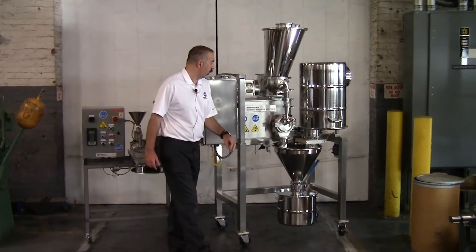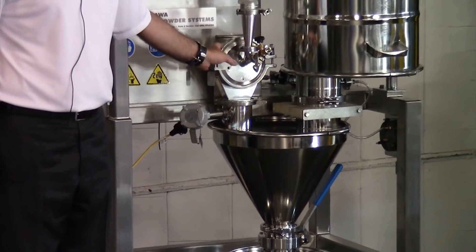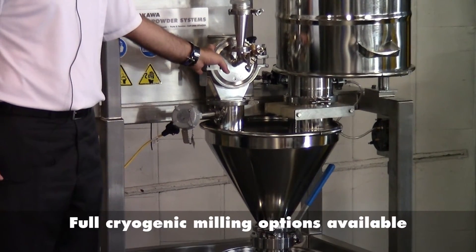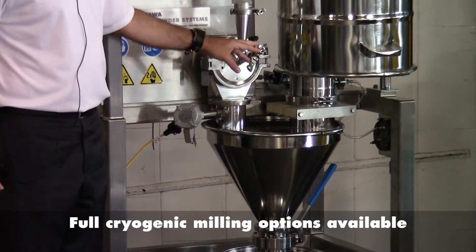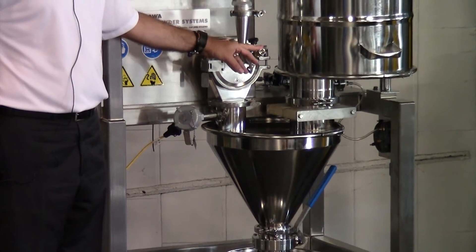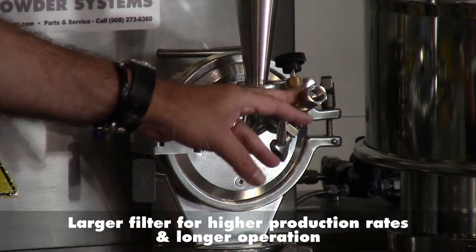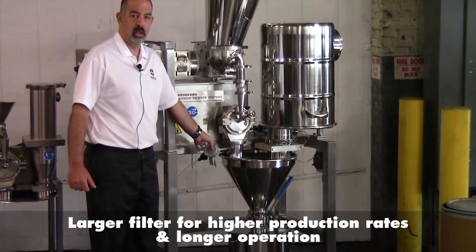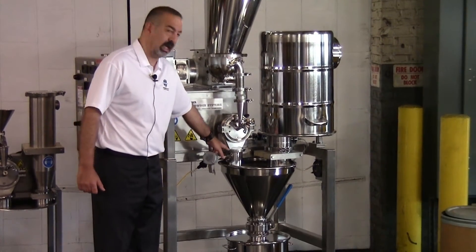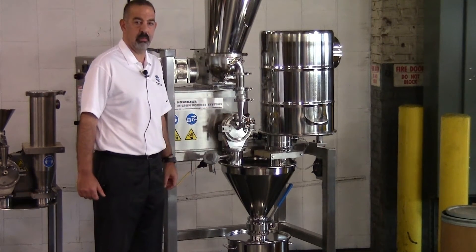Moving down on the mill, we have a pharmaceutical grade application with a 0.8 micron RA finish with electropolish. We've added a liquid nitrogen port on the front to be able to remove heat during grinding for this customer's application. And also, in conjunction with that, added a thermocouple on the discharge measuring the outlet product temperature so that we can then adjust the liquid nitrogen flow into the mill.